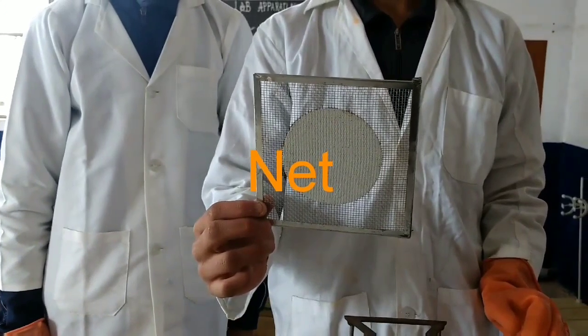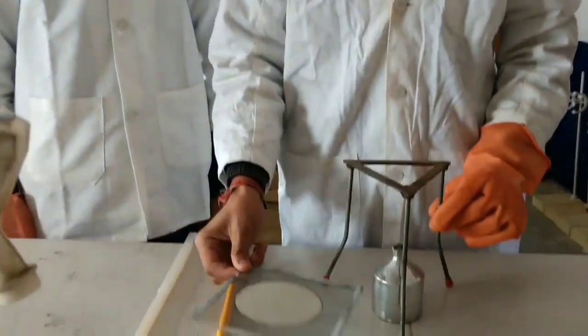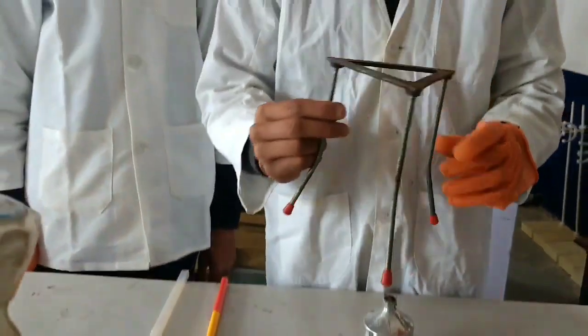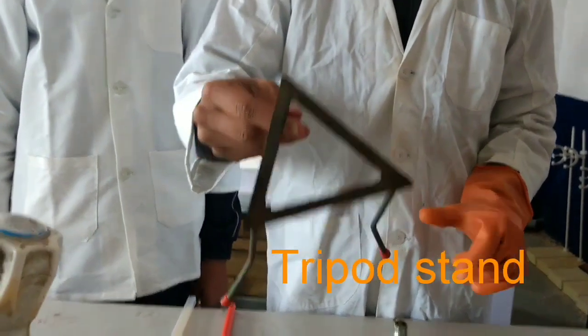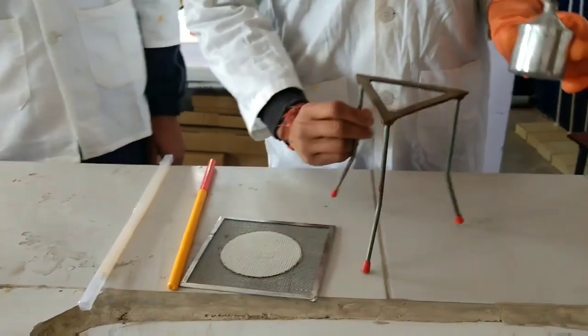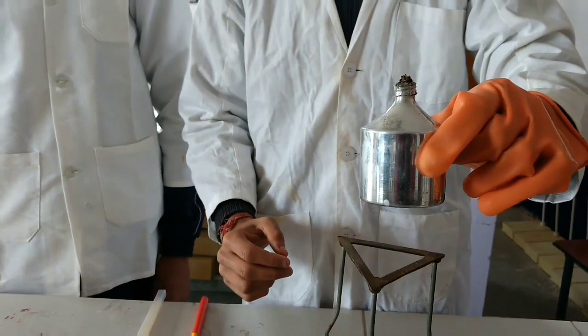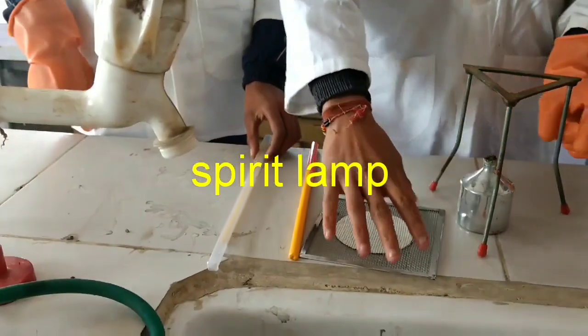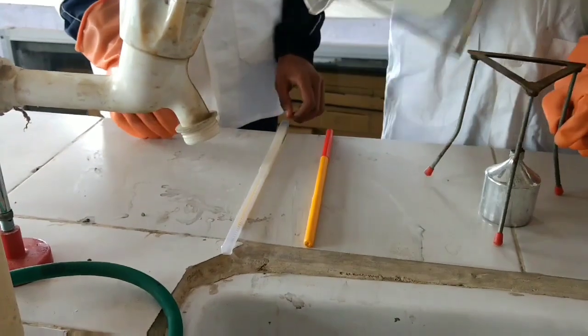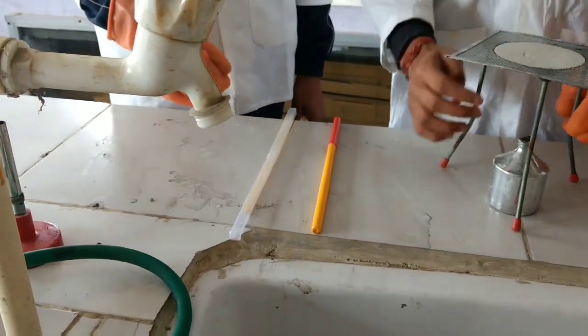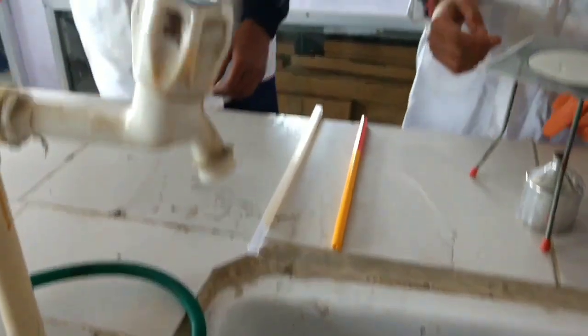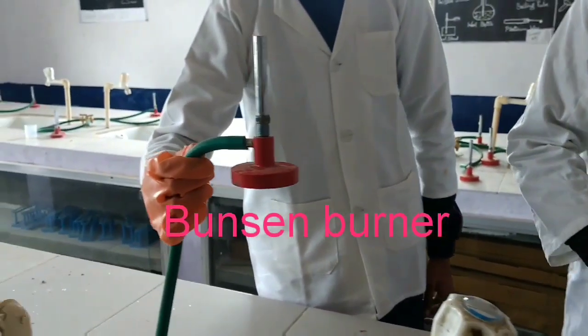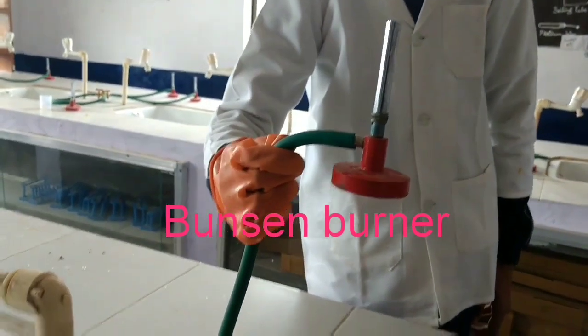So, now you can see the boiling apparatus. This is the net, tripod stand and the spirit lamp. If you are doing the boiling where less amount of heat is required, then you can use the spirit lamp or for high heating, you can use the Bunsen burner.